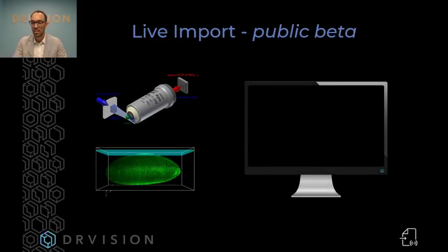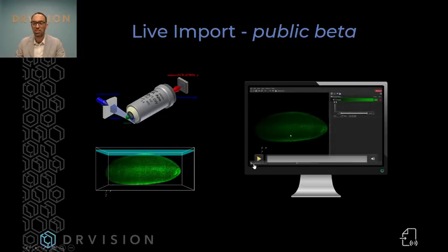And the core of this feature is essentially letting you see the images that you acquire faster. It was initially intended for light sheet microscopy because the images tend to be very large and they sometimes even have to have some pre-processing before you can visualize them. So that's what we focused on initially, but actually it works for many other types of microscopes.